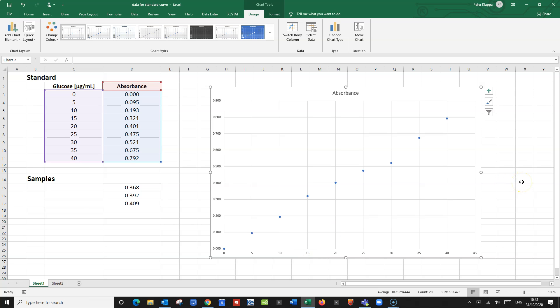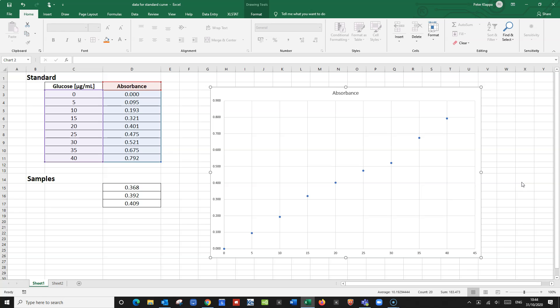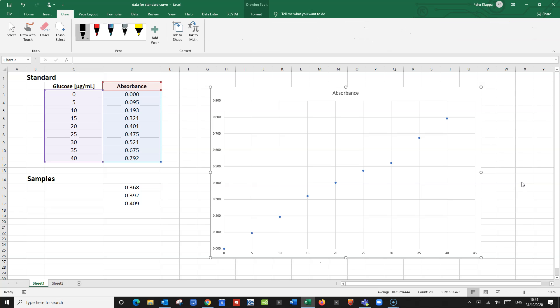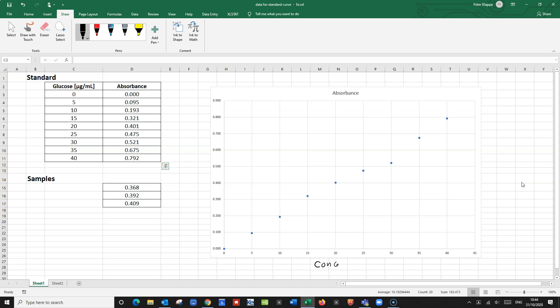For example, what we have plotted on the x-axis would be the concentration of the glucose, and the unit for that would be microgram per milliliter. And for the absorbance, we will simply indicate that with 'absorbance.' And we've got this chart.